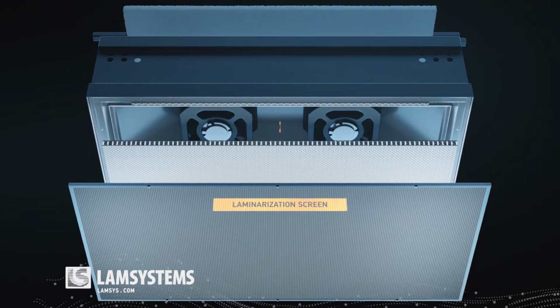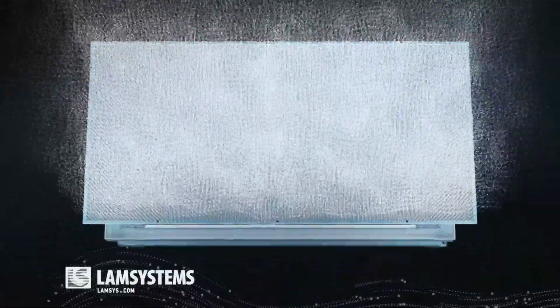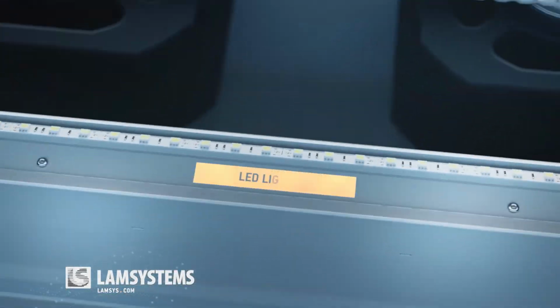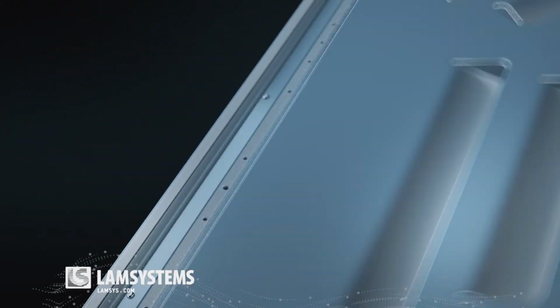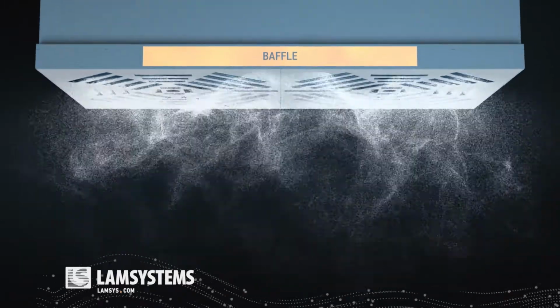Completed with laminarization screen, the filter fan unit creates a unidirectional airflow with uniform velocity, the so-called laminar airflow. The filter fan unit with laminarization screen is equipped with LED lighting system that does not create barriers to airflow. Completed with turbulator, a turbulent flow is created for better air mixing in the working area.